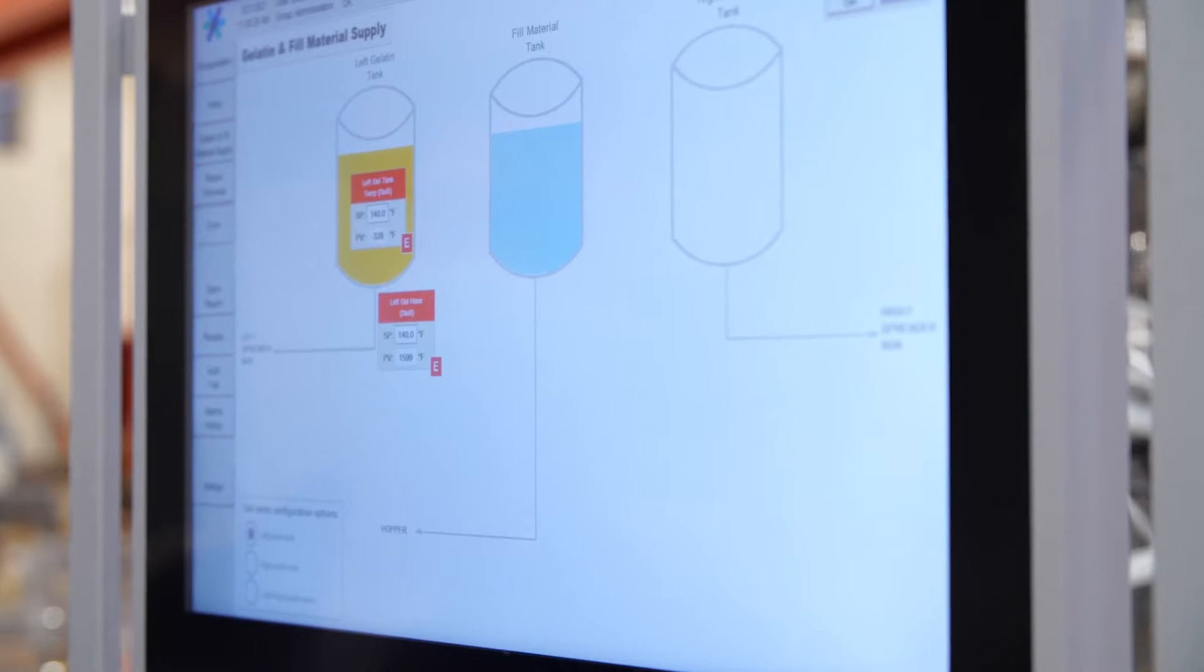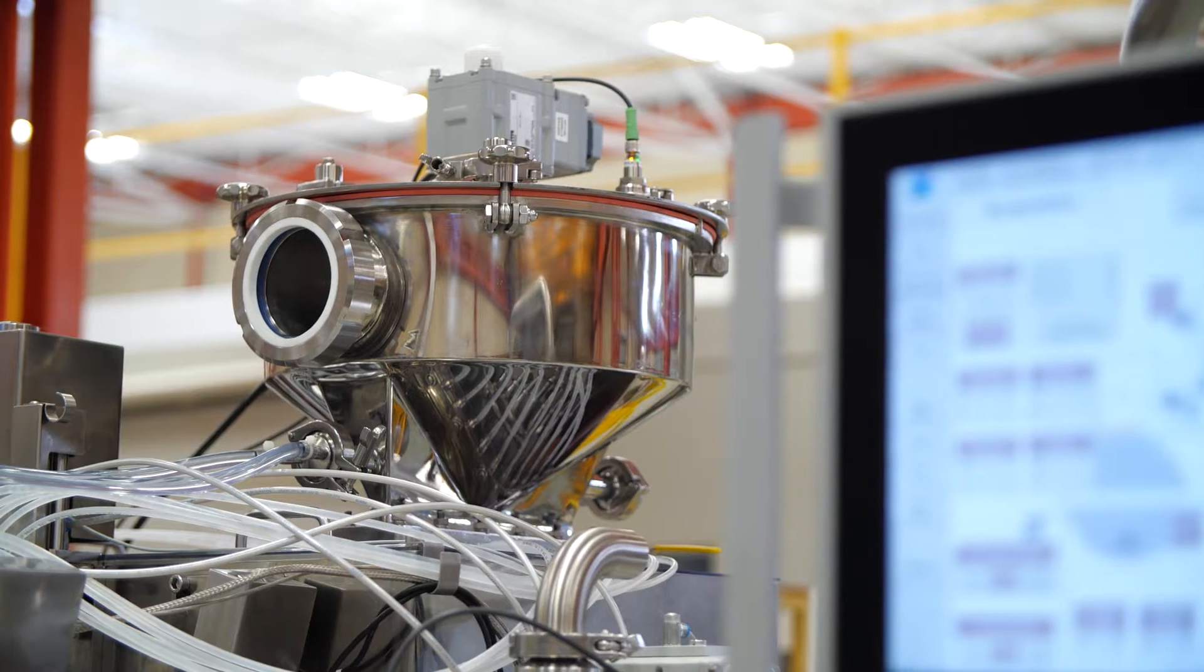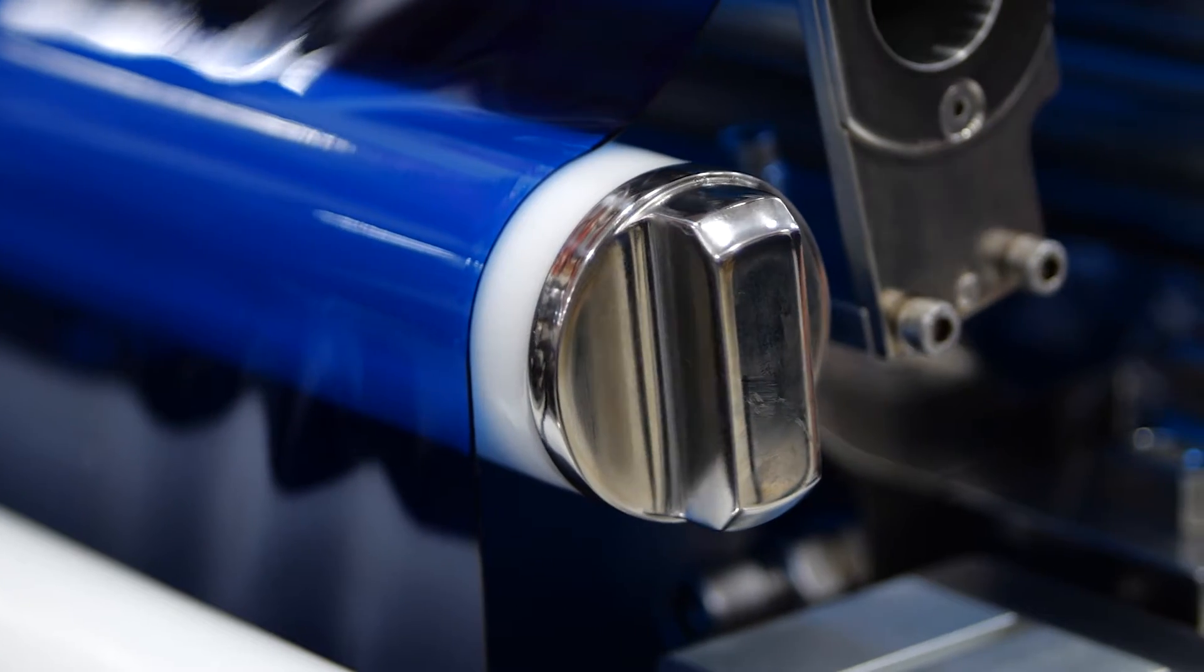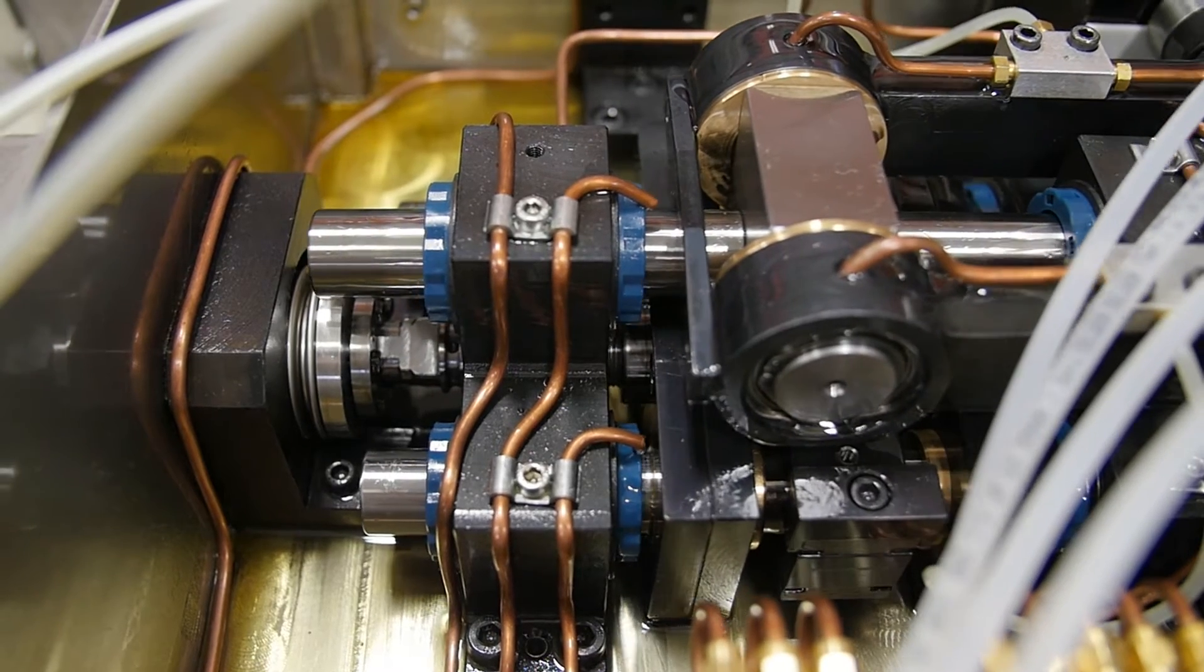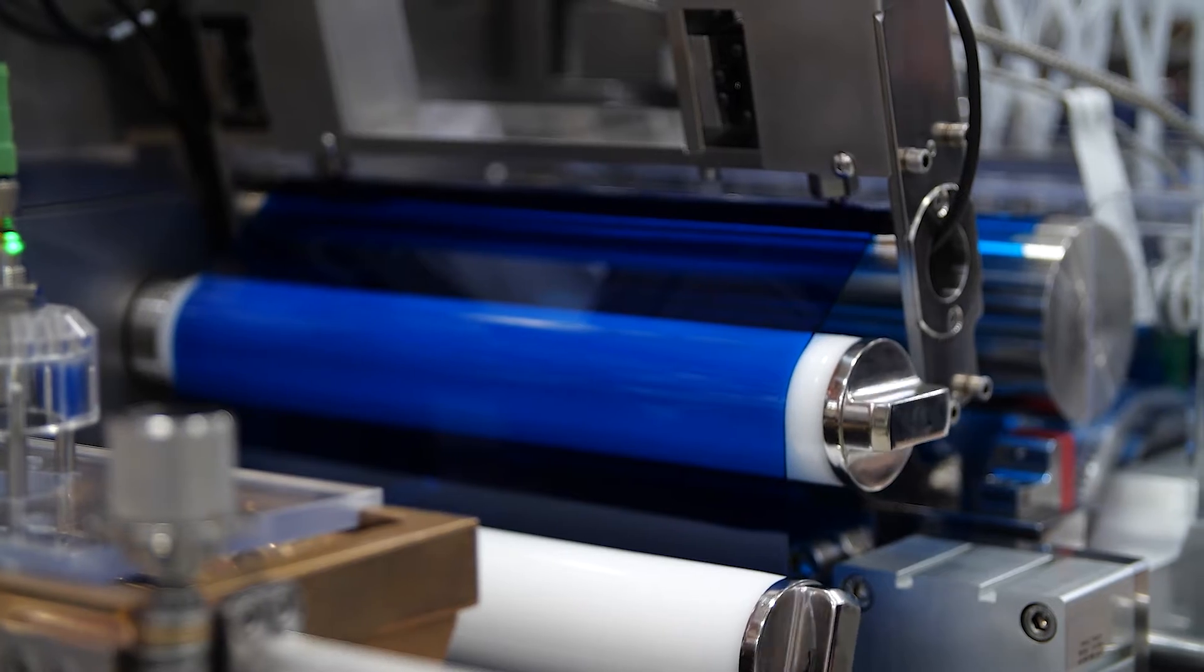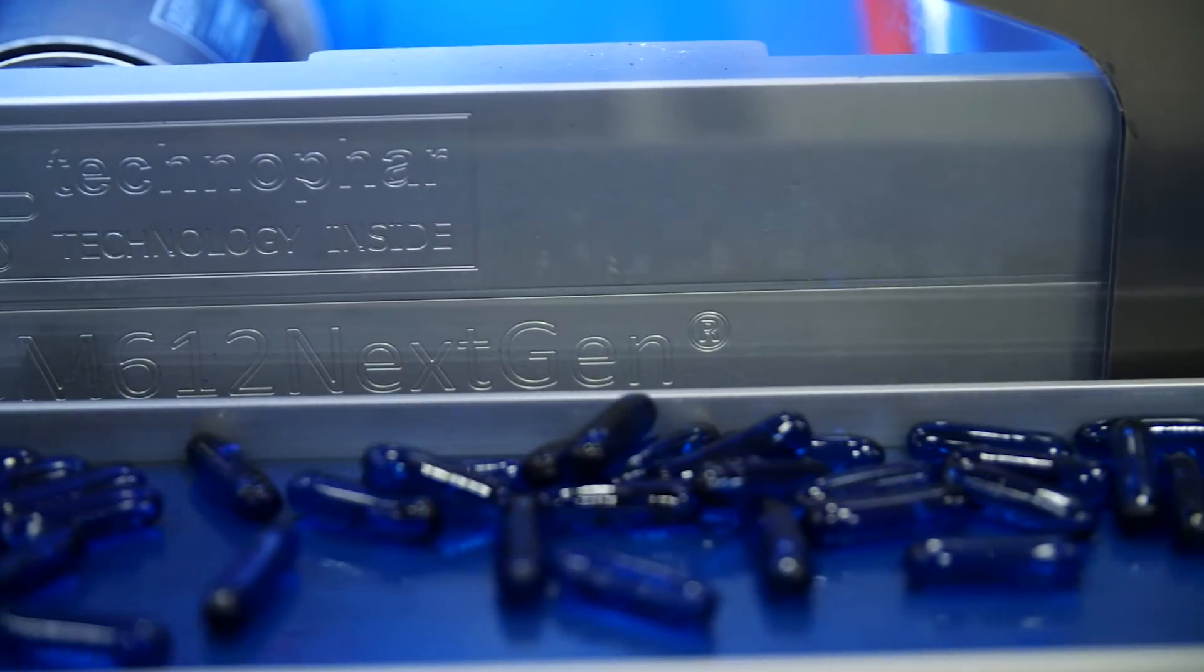The PLC screen also allows the operator to take advantage of the machine's electronic gearing. Four servo axes control the machine's stroke, die rolls, and medicine pump, allowing for full production flexibility and more precise medicine injection, resulting in overall improved capsule quality compared to mechanically geared machines.